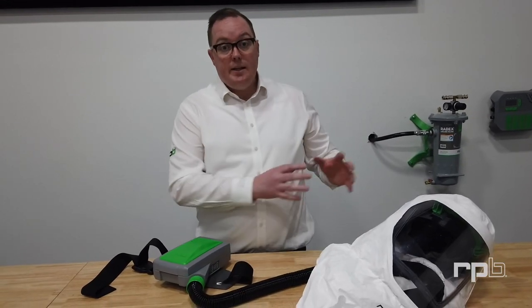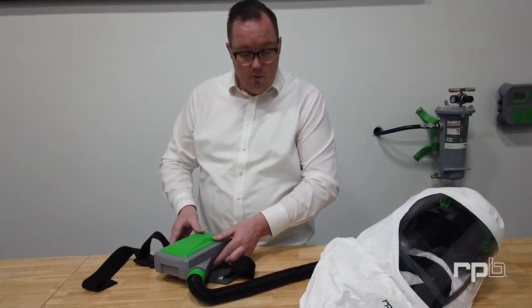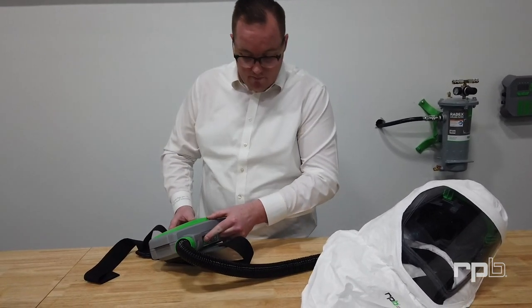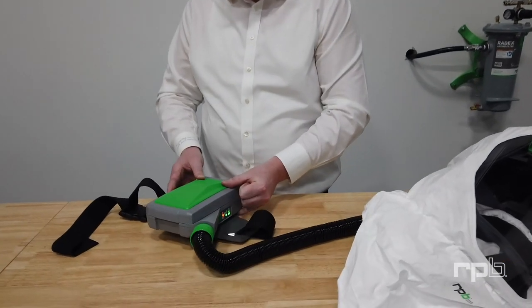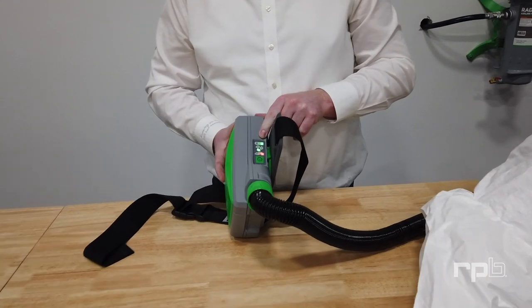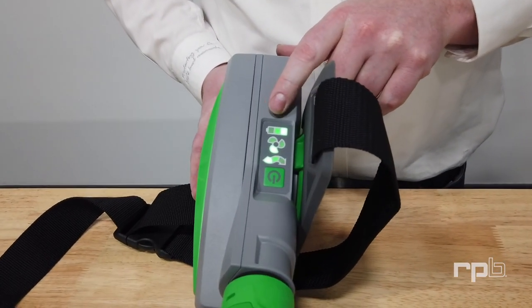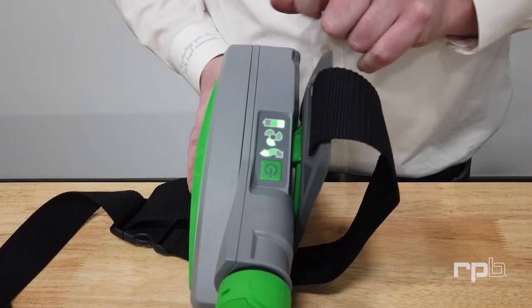Now that you've got the PX5 connected to the T-Link, you can turn it on to have airflow flowing through. When you turn the unit on, check the indicators to ensure that your battery is fully charged and that you're getting good airflow through the filter.